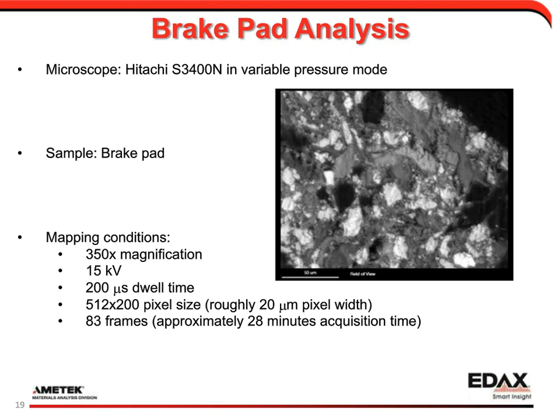And if you're outside those assumptions, then your reliability goes down. If you have carbon on top of your sample, if it's contaminated any kind of way, we will be correcting as if carbon is throughout the entire sample. And we will be applying a correction that's not necessarily real. So in this case, your numbers will be thrown off.